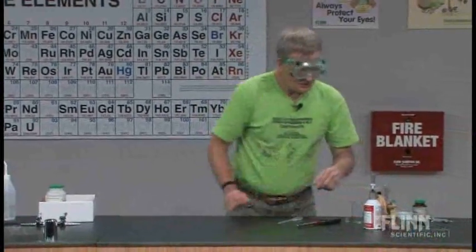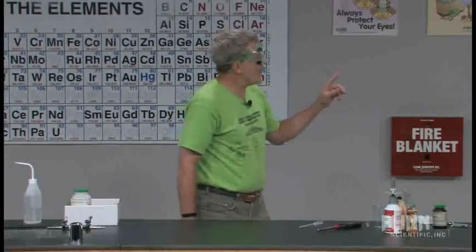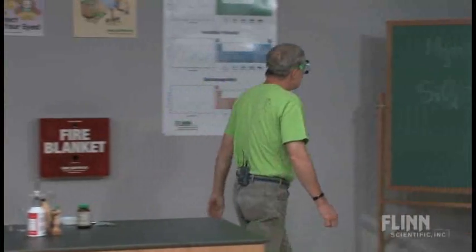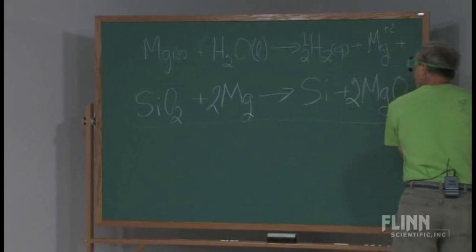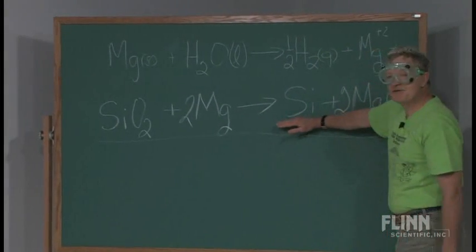But what's even neater was that after I did this the first time, I started reading some more and found out there's one more thing you can do with this. I'm going to go back over the board just briefly to point something out. This reaction that I wrote here happens inside that test tube.